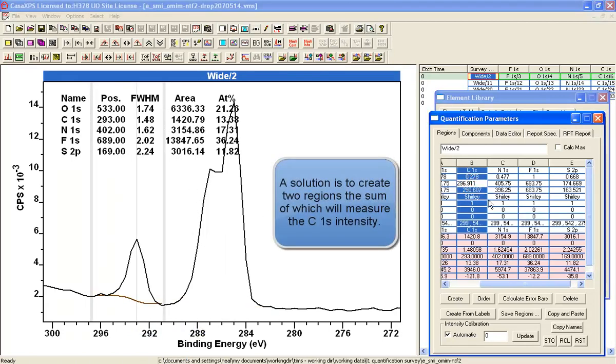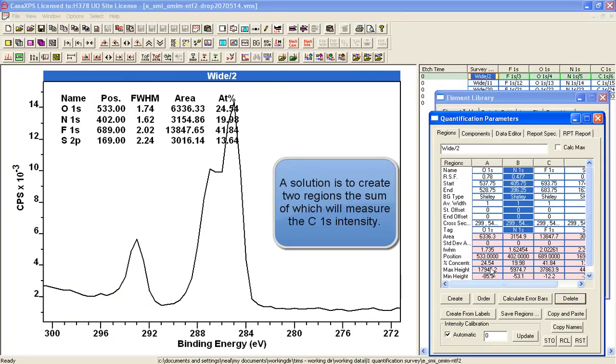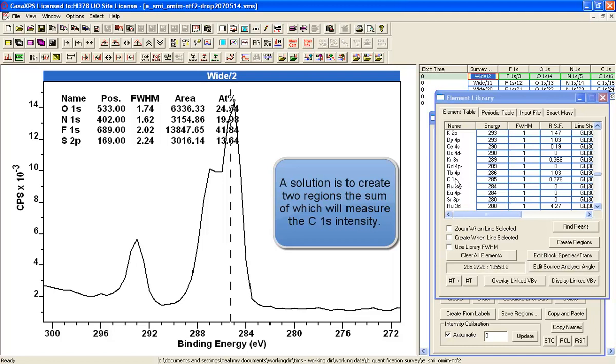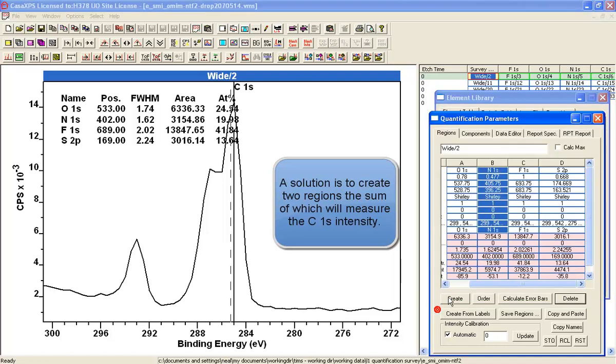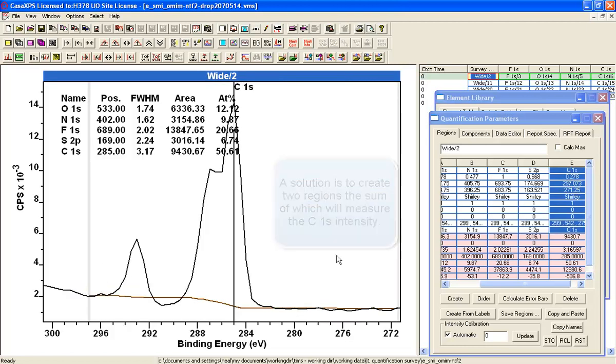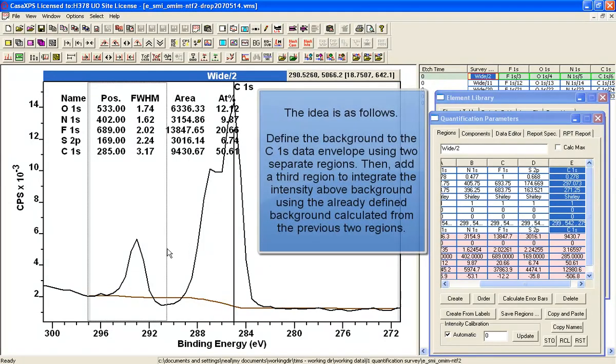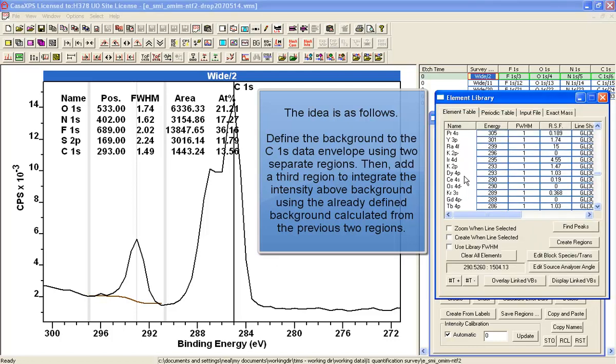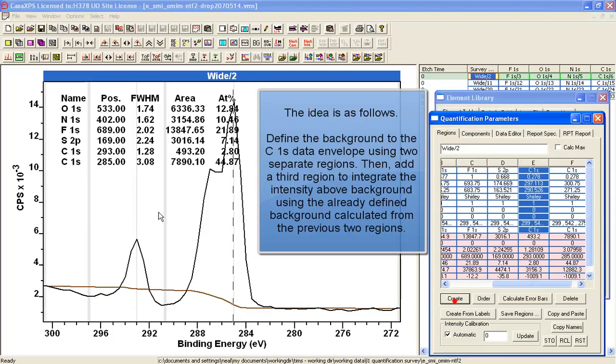So what I'll do now is make a small adjustment. So I'm going to delete that so I can keep my carbon peaks all together. And I'll recreate a carbon peak over here. And I'm going to create one that is for the small peak. And then I'll create another one. And this is going to be for the larger peak.